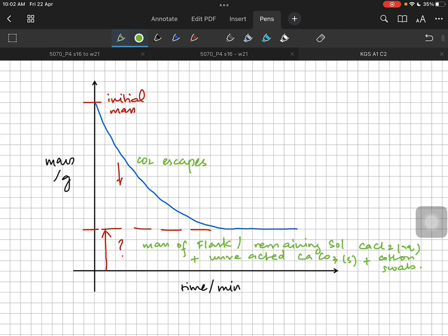So this kind of apparatus shows us how we can arrange all different kinds of chemical pieces of apparatus to have a measurement experiment for the rate of reaction. We can measure the mass after equal intervals of time. So that gives us the rate of reaction in gram per second. And then we can convert the grams into moles, because mass divided by molecular mass becomes moles. So it also helps us to calculate the moles per unit second.